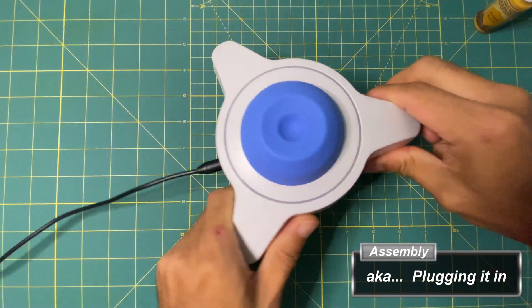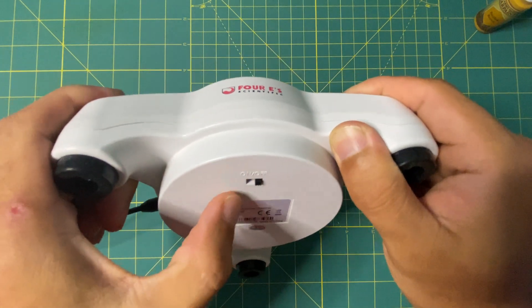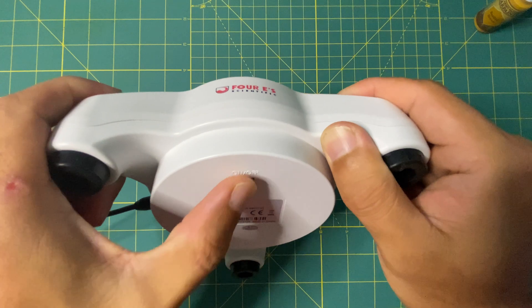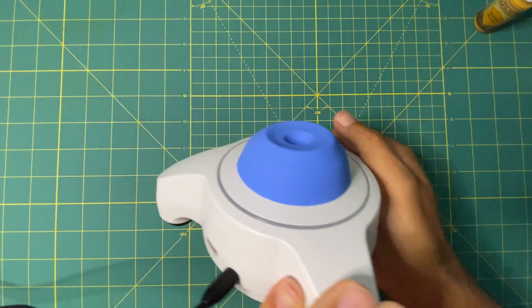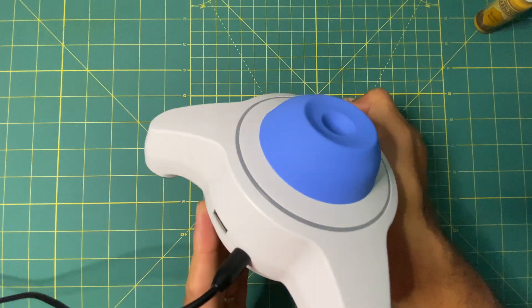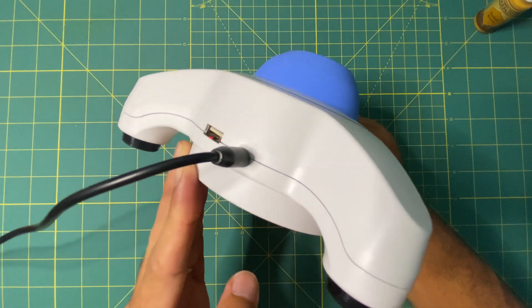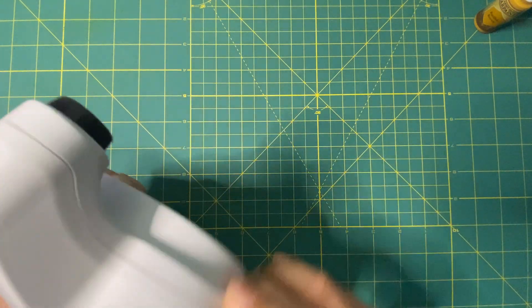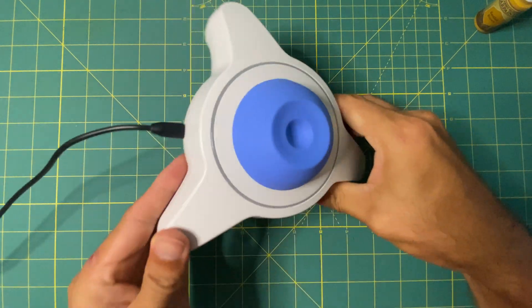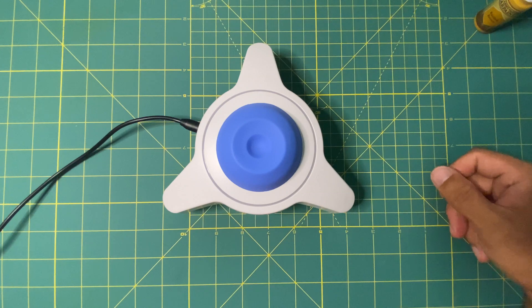I immediately found the on and off button on the bottom of the shaker, but because I'm a man and I do not read manuals or ask for directions, my first thought was that it didn't work. My second thought was to hit it, despite that having literally never fixed anything for me. My third thought was maybe the power cable was bad, but I noticed there was a red light inside the USB port, so it was getting power. After staring at the shaker like an idiot, it dawned on me that maybe it isn't activated until you push down on the rubber head, which is of course what the manual would have told me.